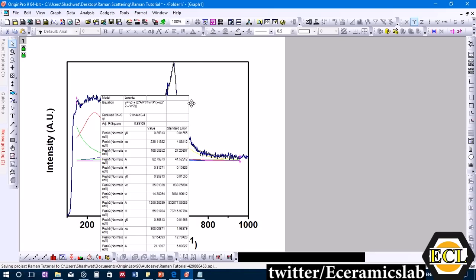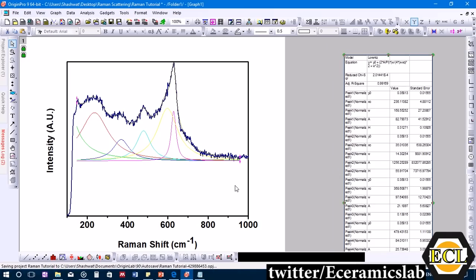A data table is shown. Looking at the graph, the original curve and the colored fitted curves are visible. Each colored curve corresponds to a deconvolved peak. This large peak is actually a combination of two peaks — a yellow and a pink one — meaning it deconvolutes into two distinct peaks.